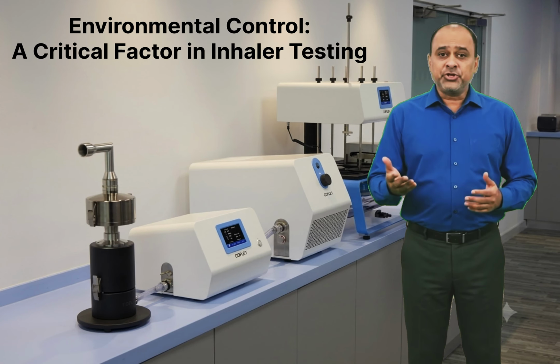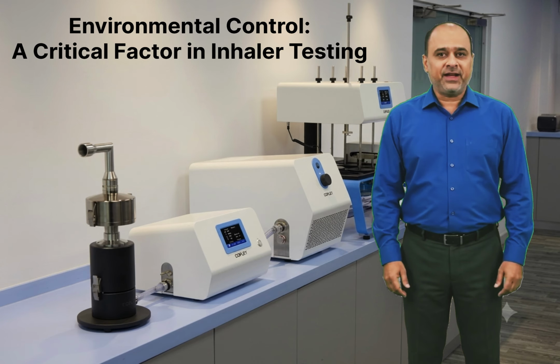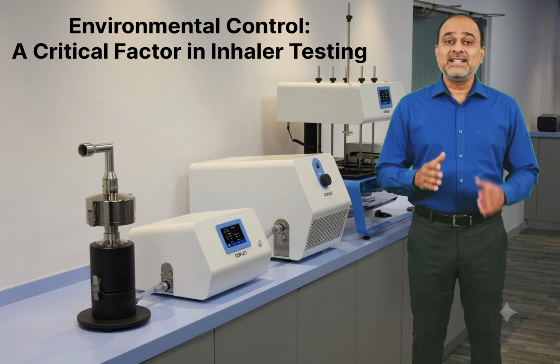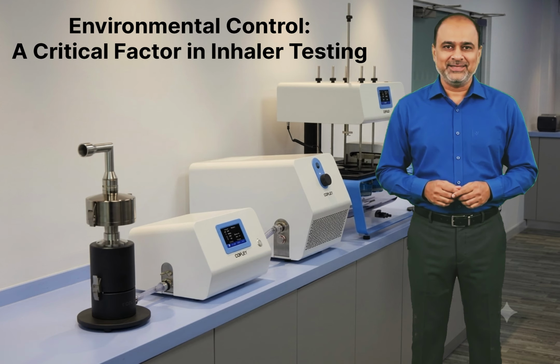Did you know that temperature, humidity, and electrostatic charge can significantly affect inhaler test results? In this video, you'll discover why environmental control is essential for accurate dose delivery and dependable pharmaceutical quality.